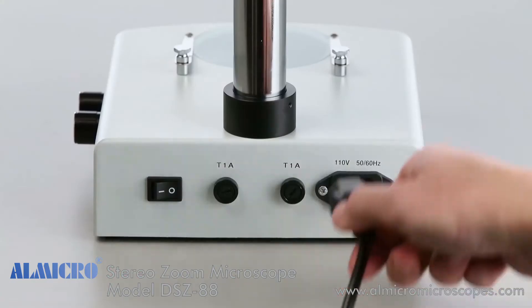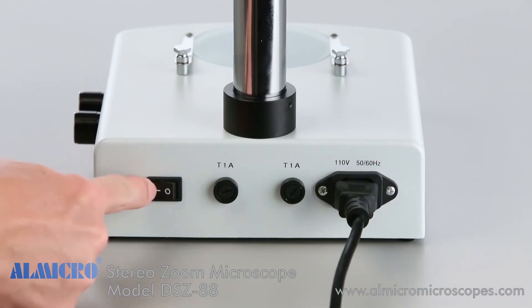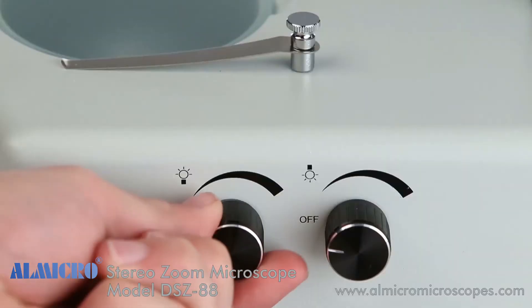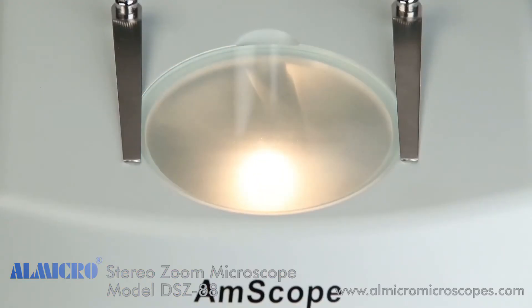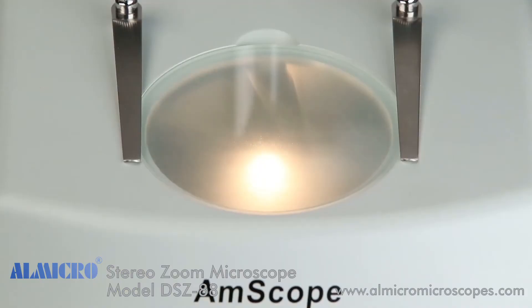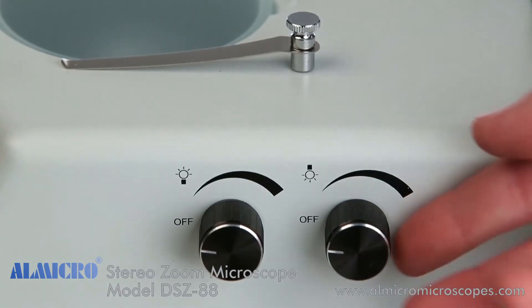Next, insert the main power cord and plug it into an AC outlet. Flip the power switch to enable the lights. The microscope has two switched dimmer knobs: the knob on the left controls the bottom lighting, and the knob on the right controls the upper lighting.